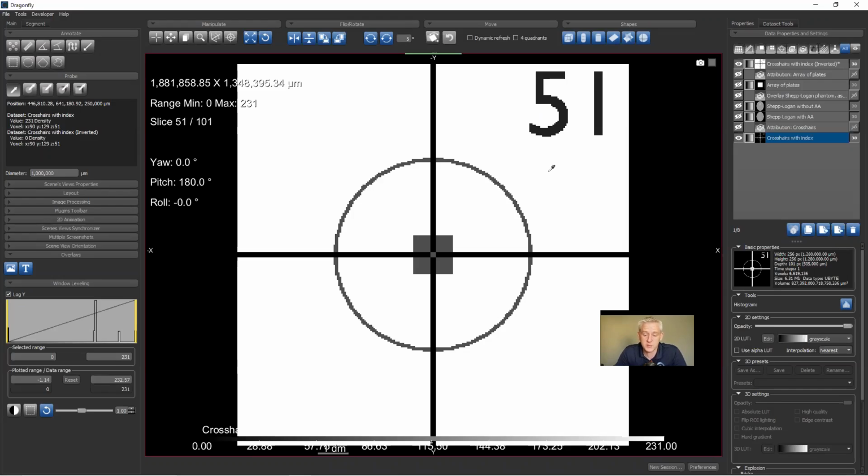This lesson is more for completeness. Some of you who have been doing image processing for 5 or 10 years know that you need these occasionally in your workflow, and so we're really sort of filling in the gaps and showing where you can access these. So this lesson is very practical for image processing experts, not quite as practical for the new users, certainly not as practical yet as yesterday's lesson on image filtering, where you can see the obvious applications. So maybe we can start a forum post or a follow-up lesson on when you're going to use some of these tools. But again, these are needed for completeness in any image processing application.